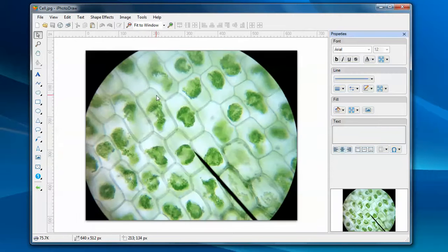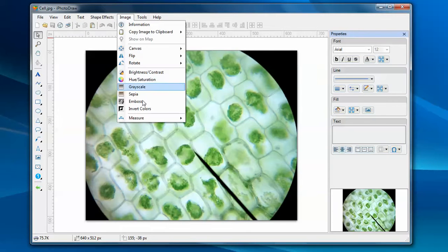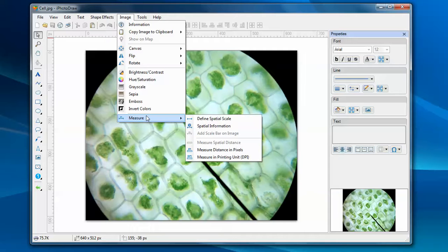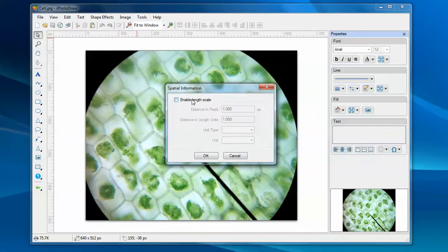Now I'm going to add scale bars on this image. Before you can add scale bars on the image, you need to define the spatial information. There are two ways you can define the spatial information. First, you can pick this spatial information menu item and check the dialog box.